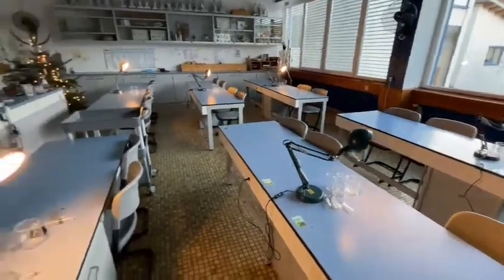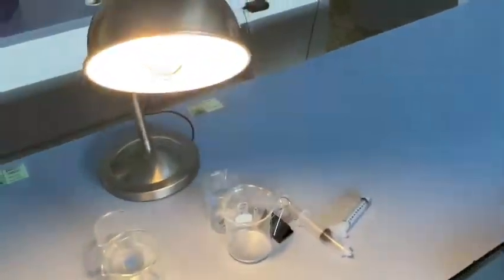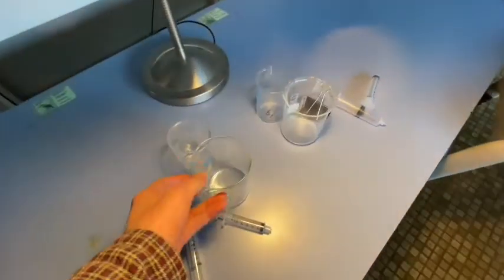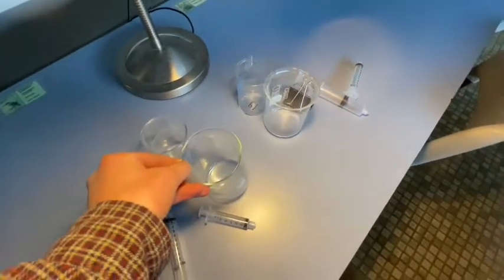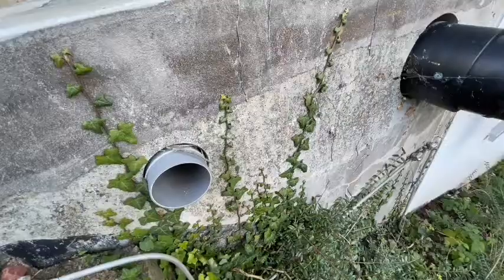So here's the setup for the lab. Each table is going to get one desk lamp as well as 4 beakers and 4 syringes. So each pair gets 2 of each of those.